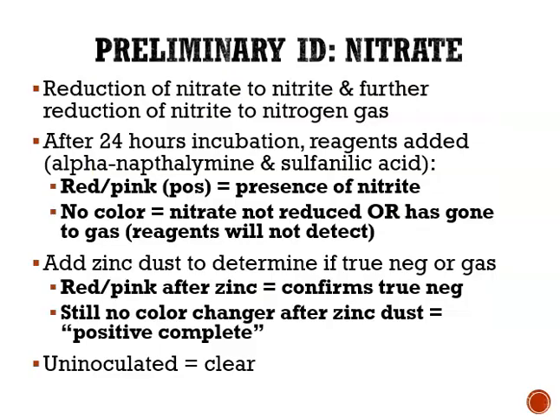Okay, the next test is the nitrate test. So this is a broth. It determines reduction of nitrate to nitrite, and it can also detect further reduction of nitrite to nitrogen gas. So this one is a little bit tricky. The reagents are added, so your reagents are alpha-naphthylamine and sulfanilic acid after 24 hours of incubation.